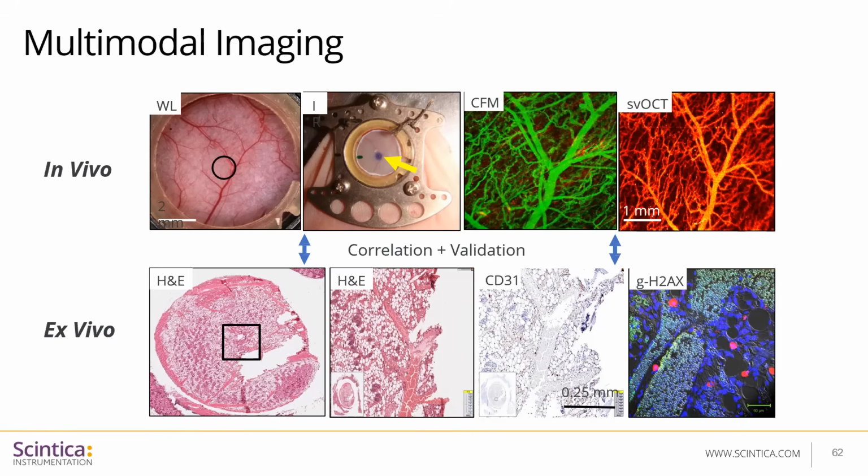And overall, it will always be a good idea for you to correlate your obtained results in vivo with ex vivo stains and validate the results that you have obtained and quantified with intravital imaging.